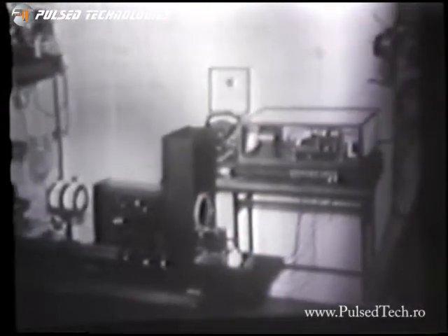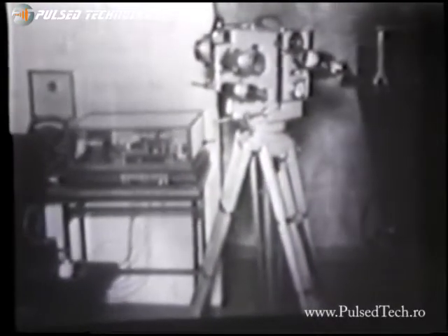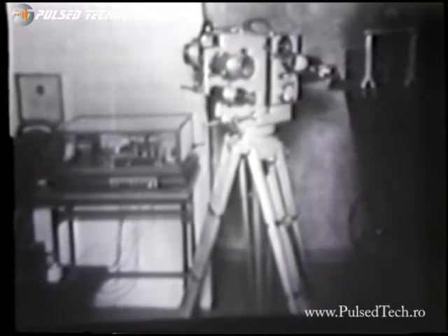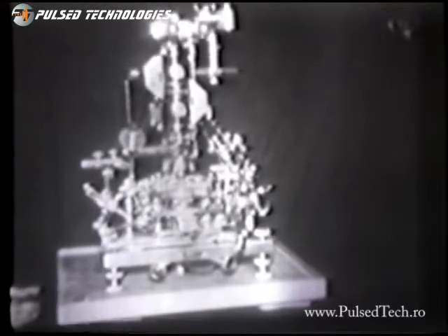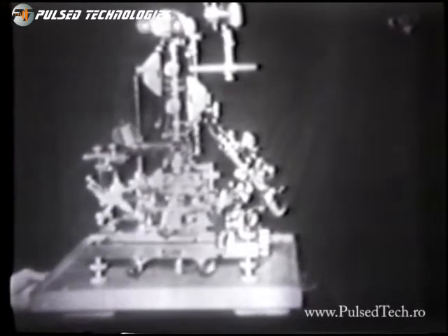This is a stop-motion photomicrograph machine that was used to make delayed versions of the growing of flowers or the growing of viruses, the growing of plants, the growing of worms, which are all recorded. This is an Ascania research camera, 35mm, that Rife used in his work. And this is a number 2 microscope. A virus microscope was a prismatic instrument. And this is the number 3 universal microscope, prismatic type.